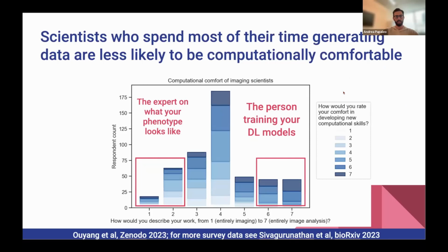One of the biggest pain points with that is understanding and learning deep learning and machine learning, especially as someone who is primarily a biologist who spent their career, their schooling, learning biology. They don't want to try to learn a whole other field. There are plenty of tools out there that you can use that can do this for you on your computer. So there's Cell Profiler, which is a very popular tool.